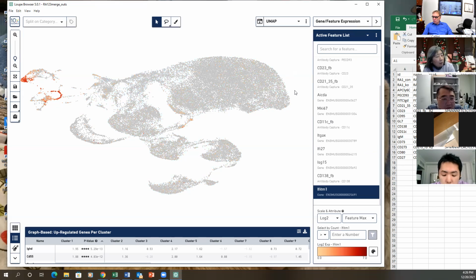It means that my hash antibody is not enough. Yeah, I used too many. I added 20 million cells or something, which is too many. Then relatively the antibody is not enough. The antibody is supposed to stain all cells, but some cells were not stained.